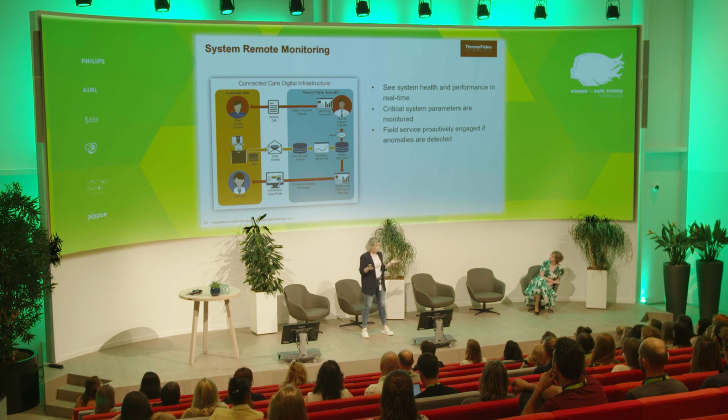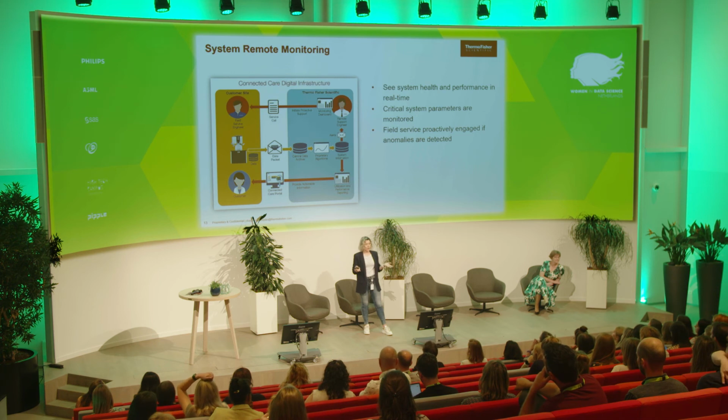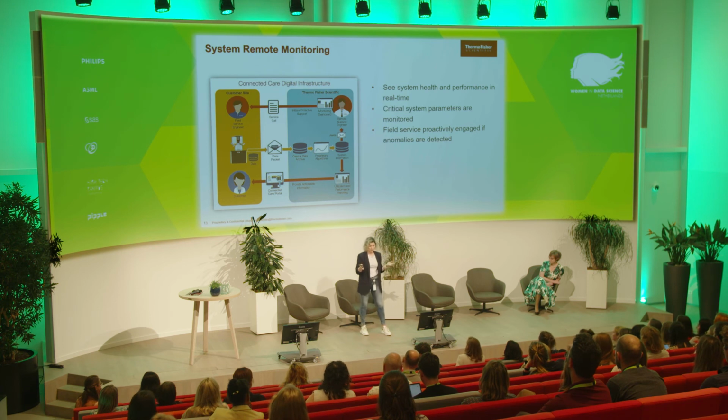So what are the steps? We create a massive amount of data in our microscopes since they are really complex systems. We transfer this data to a secure data archive, and then we run our algorithms and models on this data. We create valuable insights and information. There are two paths for these insights. One goes to our service organization. Our technical experts monitor the alerts, and if necessary, they notify service engineers and application engineers, and they try to remotely connect to our microscopes and fix the problem. If they cannot, then a field service engineer goes to the customer site. So this is a much better way.